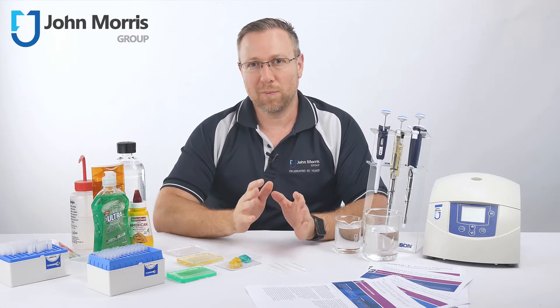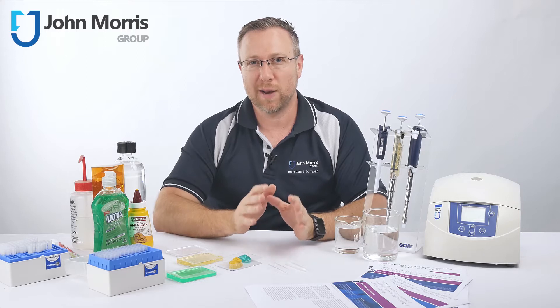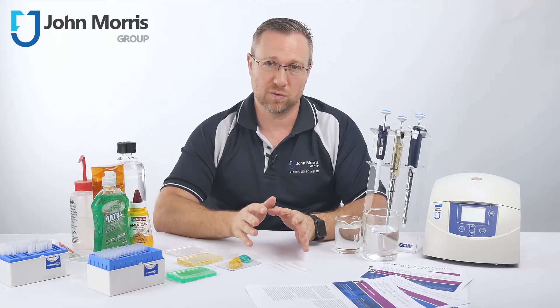Today we're looking at pipetting problem liquids — that is liquids which commonly seem to cause troubles when you try to pipet them accurately. They either appear to fall out of your pipette, they won't suck up correctly, or they give you erratic results.